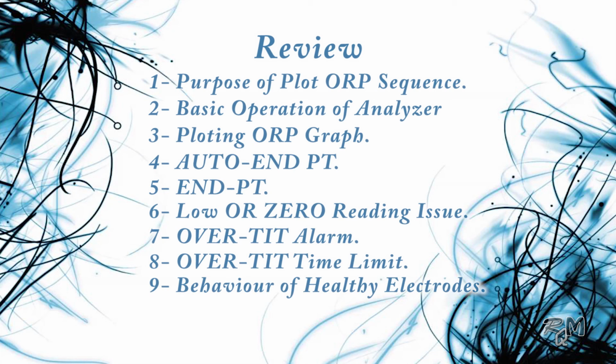We have discussed the behavior of healthy electrodes and also observed the trend of healthy electrodes. Okay guys, hope you understand the purpose of plot ORP sequence and how we can use it to get our auto endpoint as well as health verification of both electrodes.